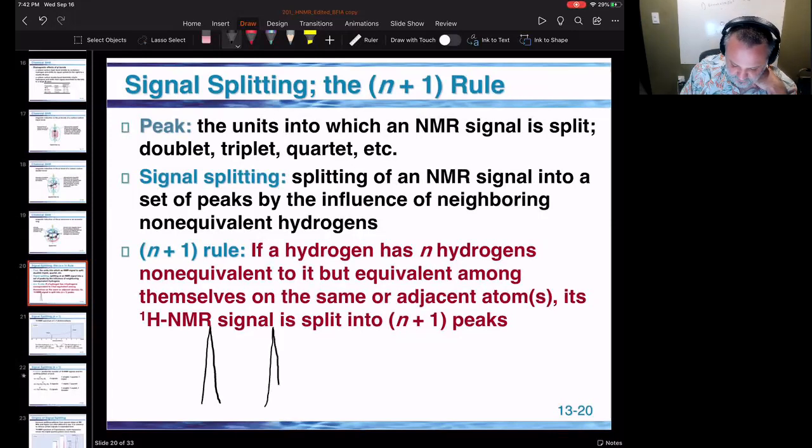But that signal could split into two very close peaks that are right next to each other, centered around the same ppm, and we would say that this is a splitting pattern. Now, if I were to actually draw it correctly, I would want it to have essentially the same total area as the peak before. And this would be what we'd say the splitting here is a doublet. It could split into a triplet.